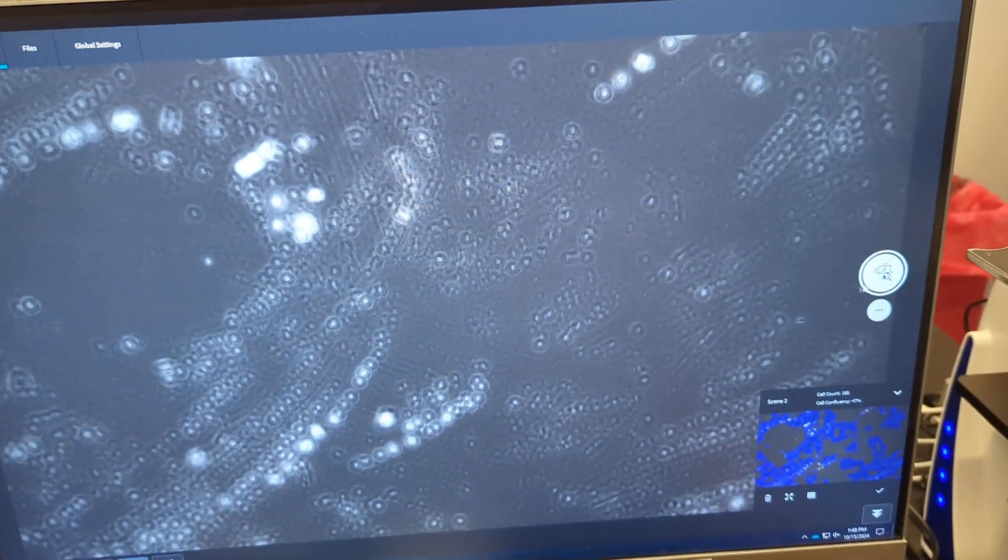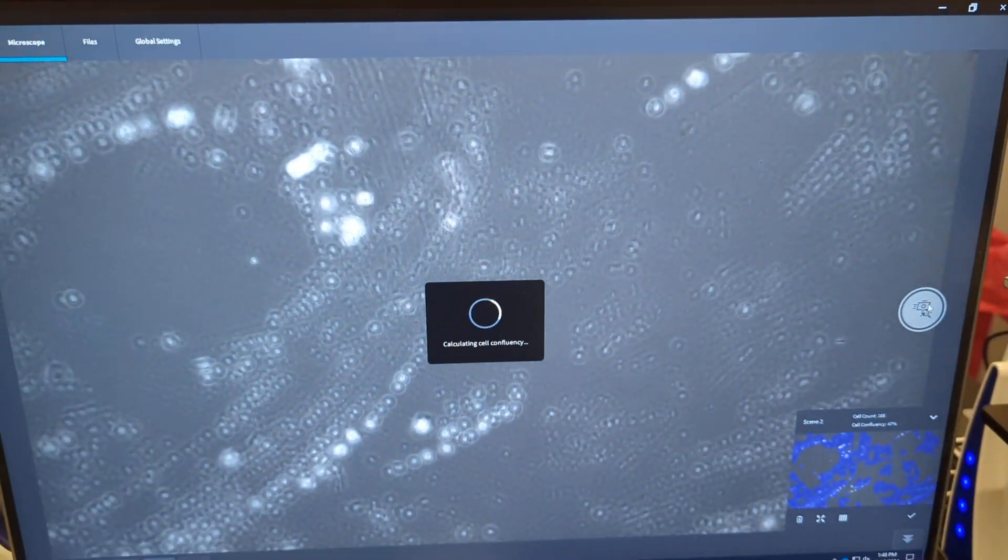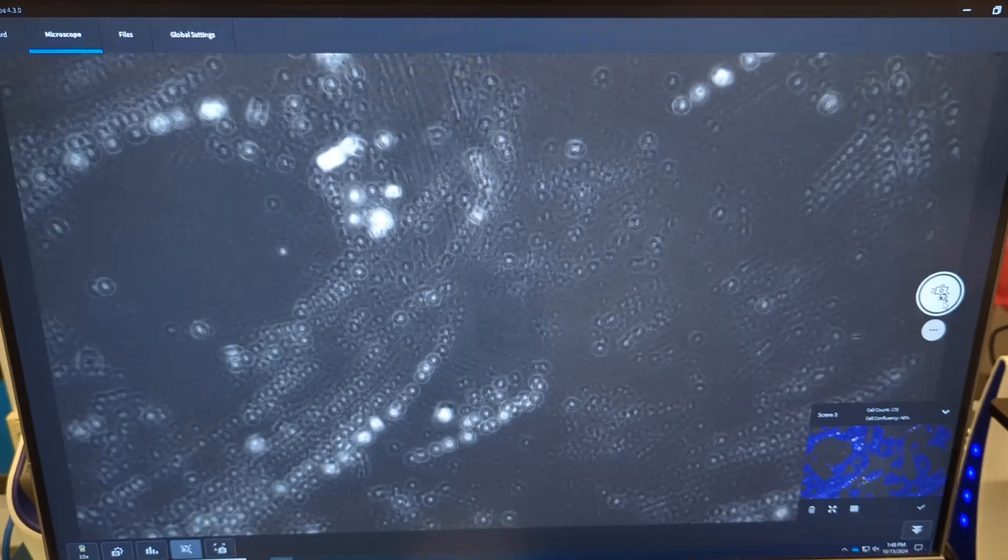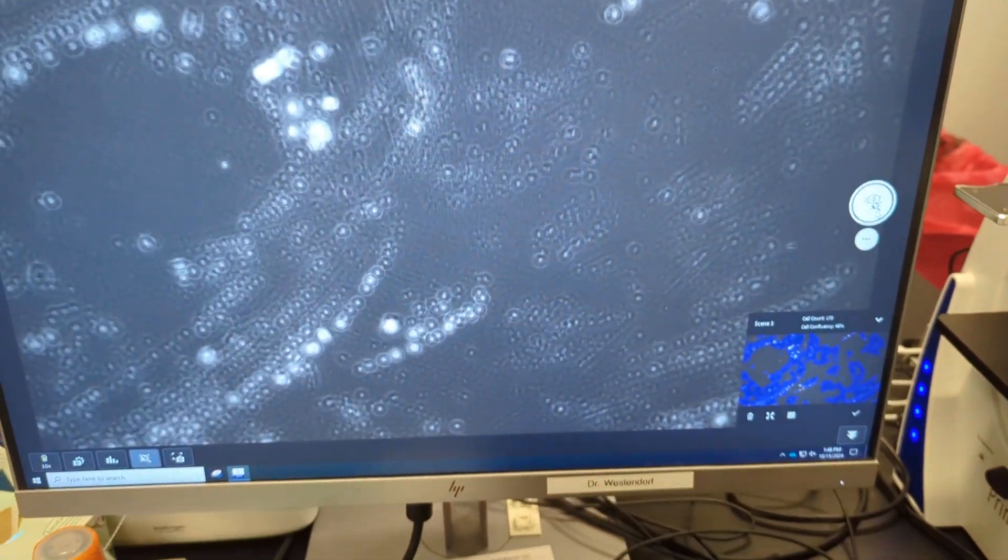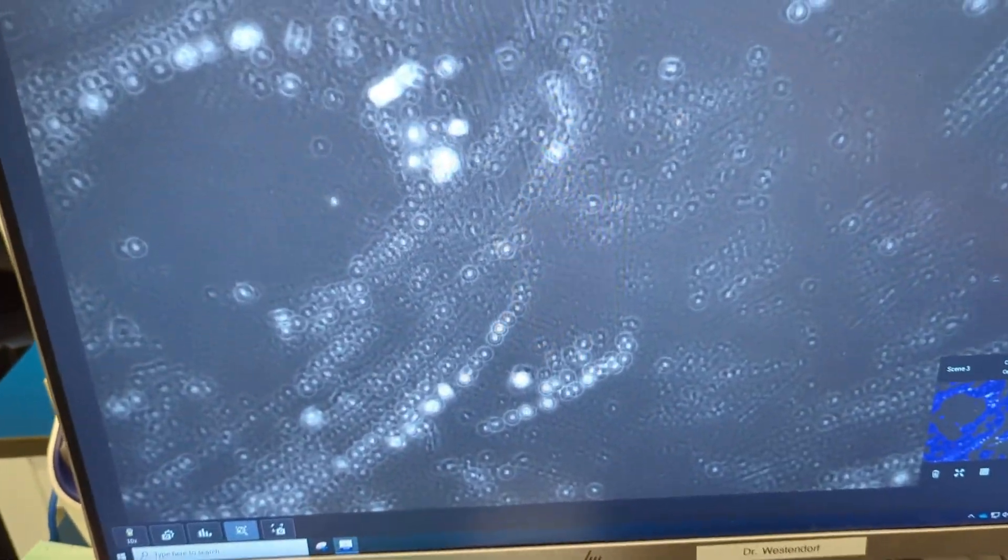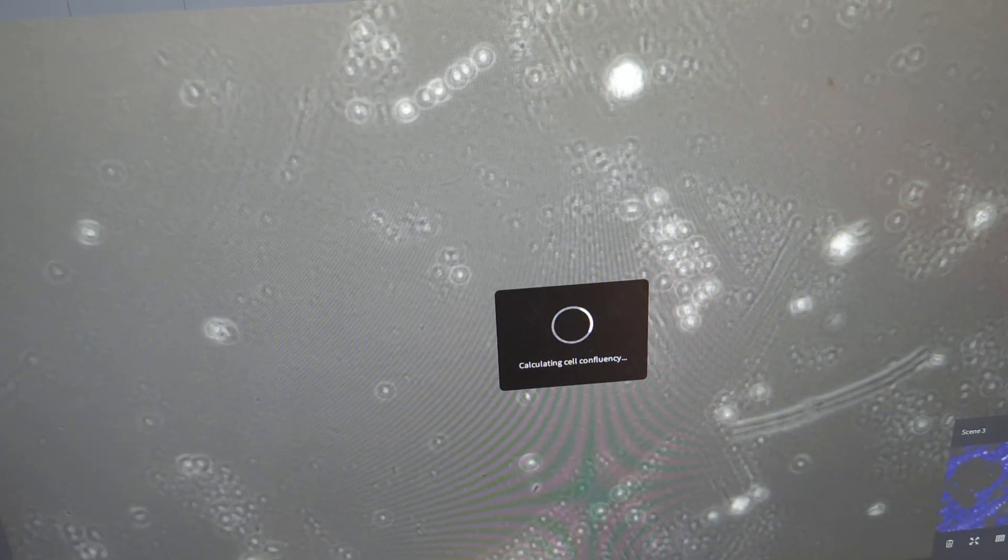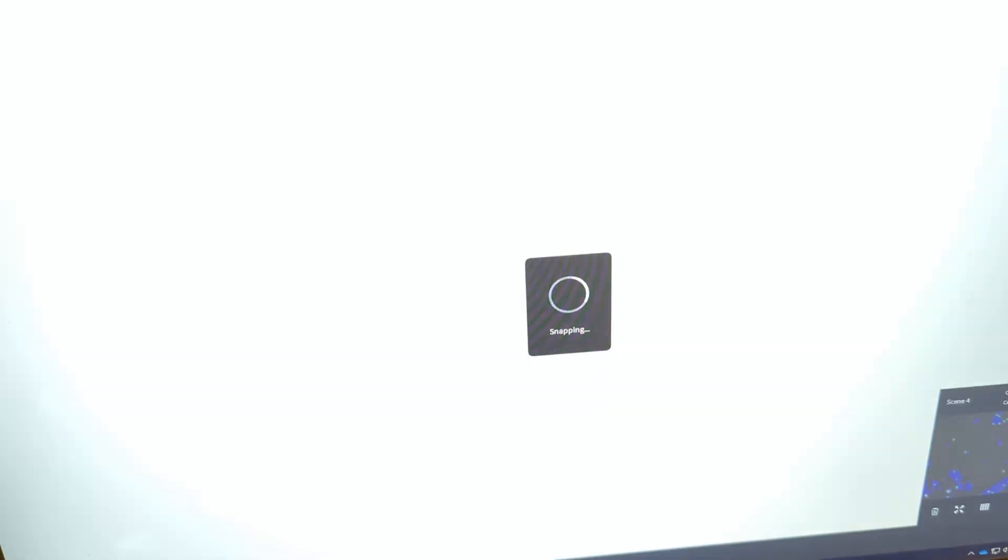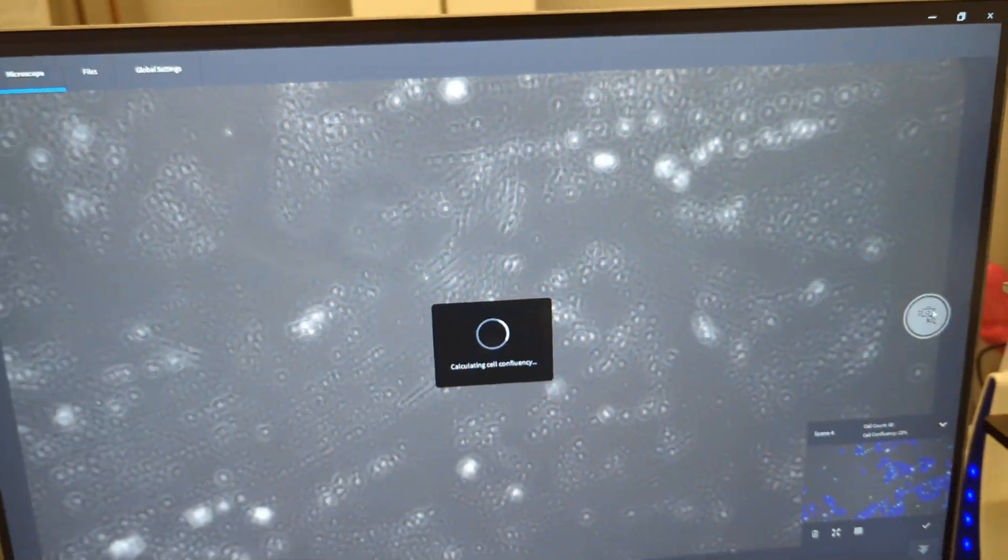And then we'll do that one more time, to get three scenes. You can do as many scenes as you want, as many images as you want. Oh, I forgot to move it. We'll do five. So I'll move it a little bit, do another one, for number four. And then I'll move it again, do another one, for number five.